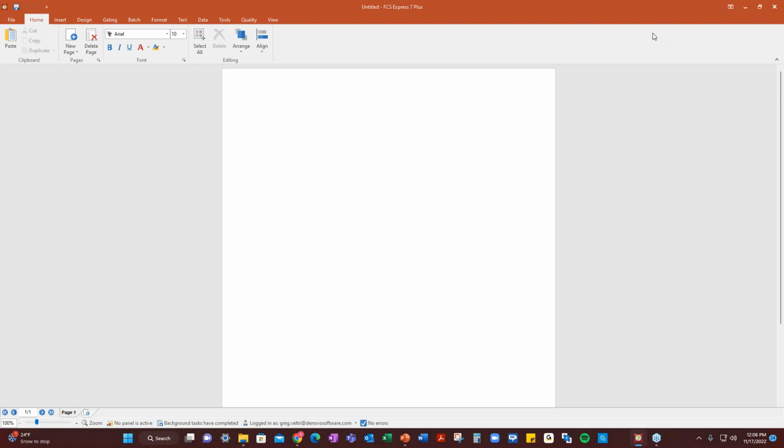Okay, so what I have here is a blank template, and give me one moment.